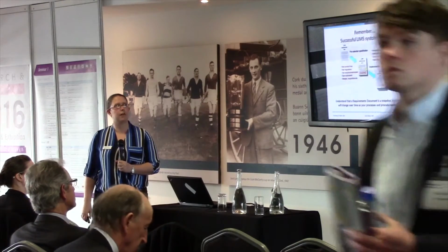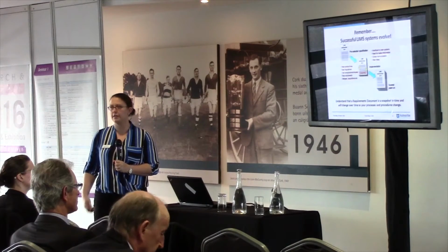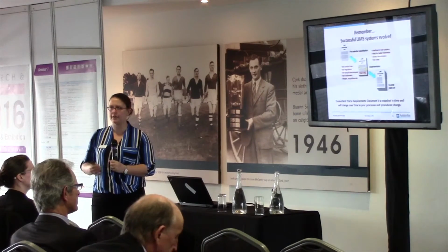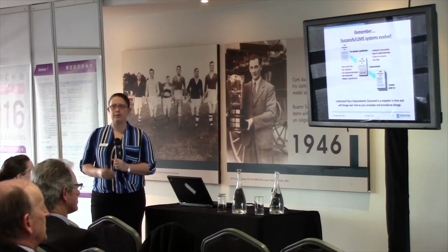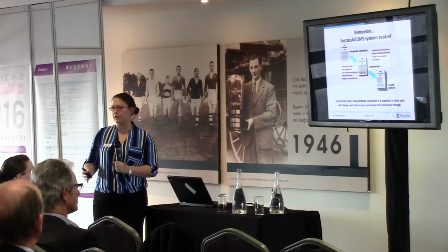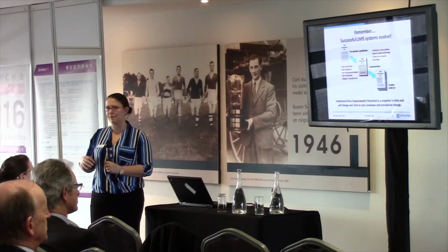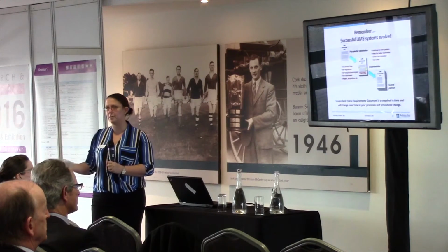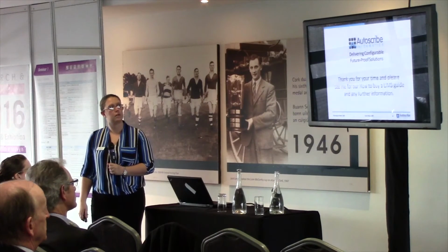This is really just covering that point again, but a successful LIM system will change. Tests will change. Tests need to be added. Reports are going to need to be added. Having a requirements document is great, but it is just a snapshot in time as to when you actually purchase that LIM system. It's not going to be necessarily relevant in 12, 18 months' time because things will have changed.